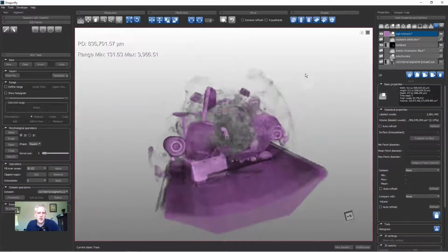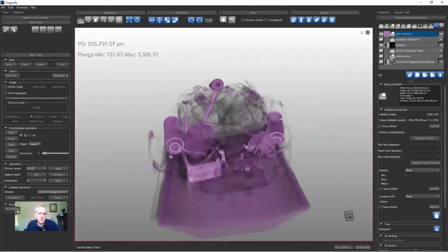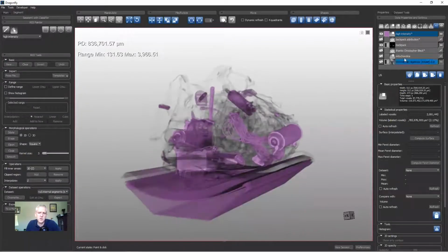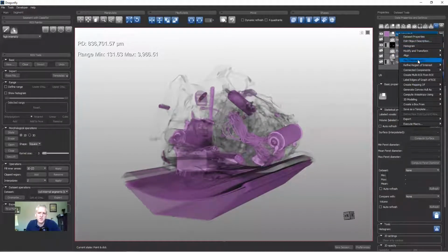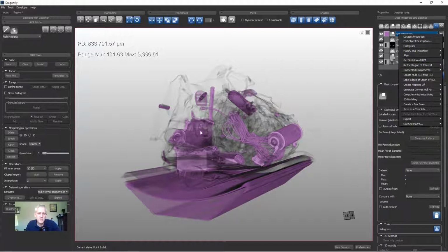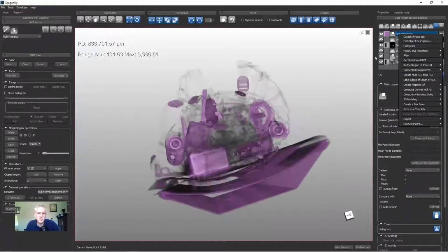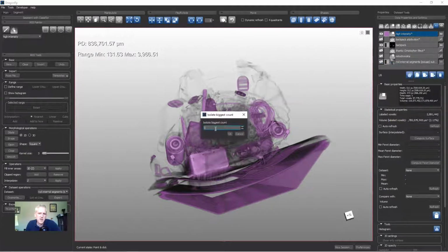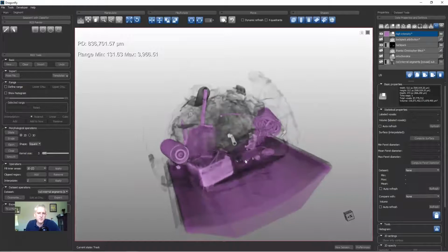Now, let's suppose I wanted to remove small objects, or I wanted to extract just a large object. So let me show you what I mean. One thing I could do is right-click here on high intensity, and go to Refine Region of Interest. Process Islands, we're going to look at this more in Lesson 10. Process Islands is very powerful. Let's suppose I wanted to process this and give me just the largest object, for example. If I go to Refine Region of Interest, Process Islands, and I say Isolate, and it says nth first biggest, so isolate 6 connected, nth first biggest. If I click this and I say I just want the one biggest object and hit OK, then it has pretty much gotten rid of everything except this.